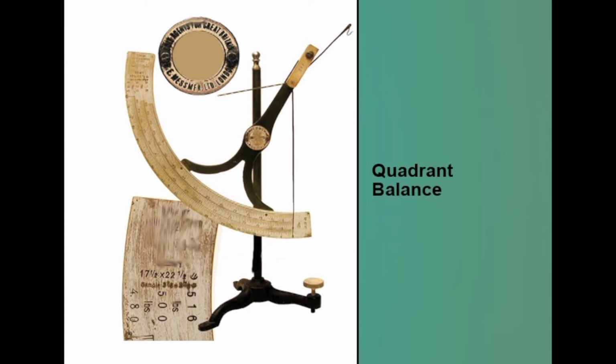So, it also has a cross beam with a hook on which you can weigh the fabric or the yarn, and there is a pointer which runs on the scale, that is, the 3 types of scales that are present. So, the yarn, of sufficient length for the measure, is put onto the hook, or the fabric, and then we can get the weight immediately because the reading is shown on the scale.